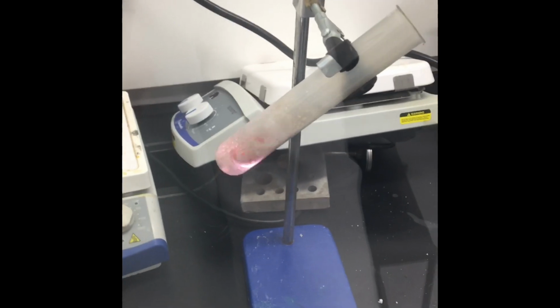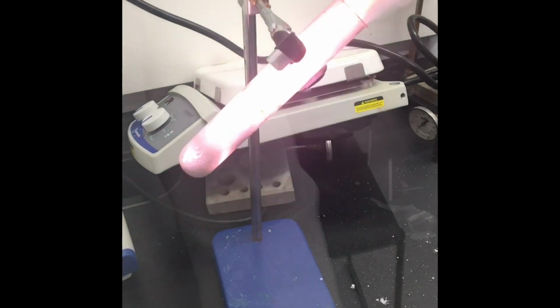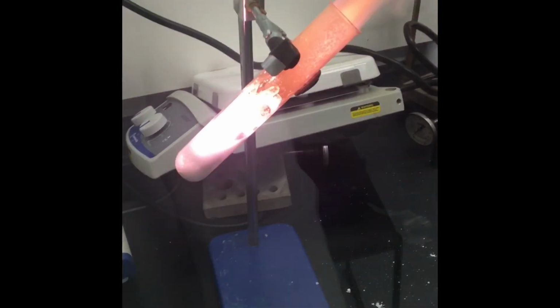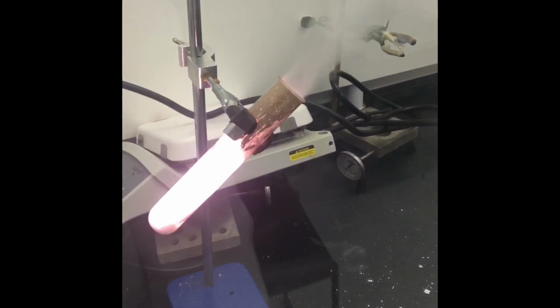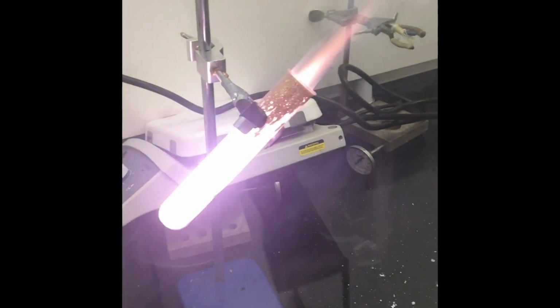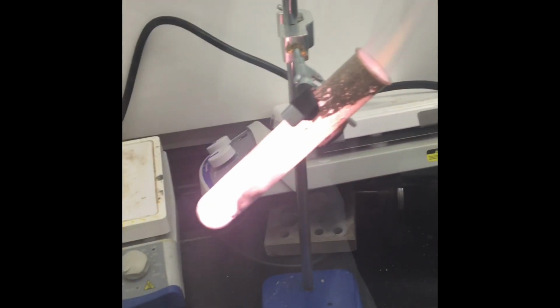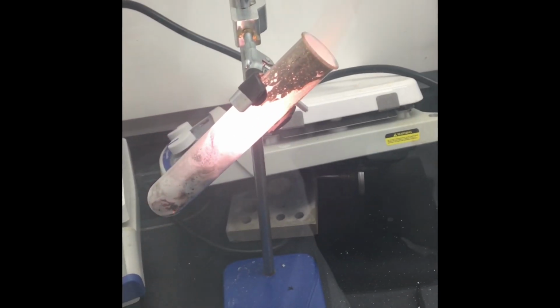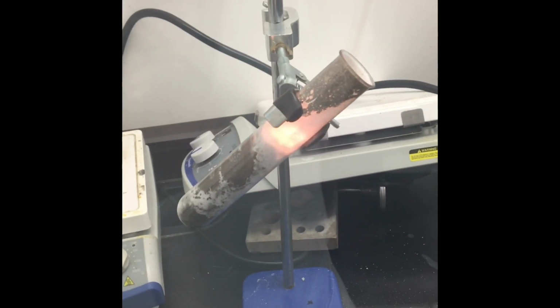Whoa, okay. Ooh. So it looks like it's exactly the same, except a little bit more intense. And that doesn't have to do with the type of treat that we're using.